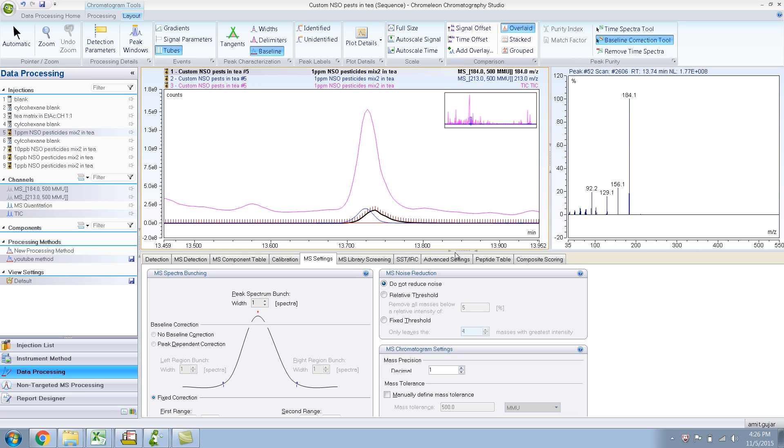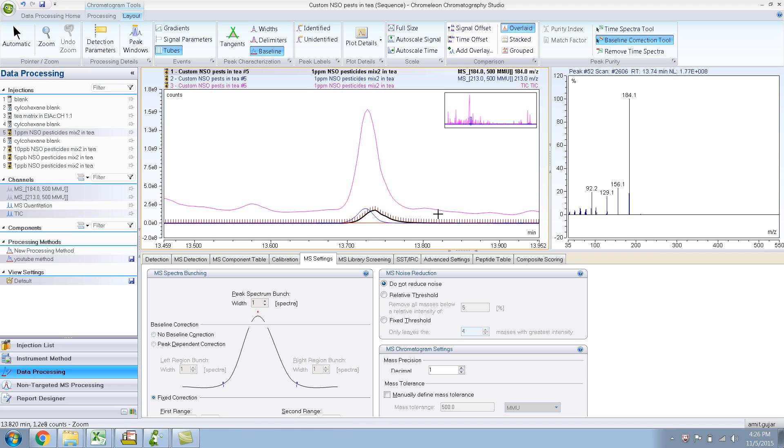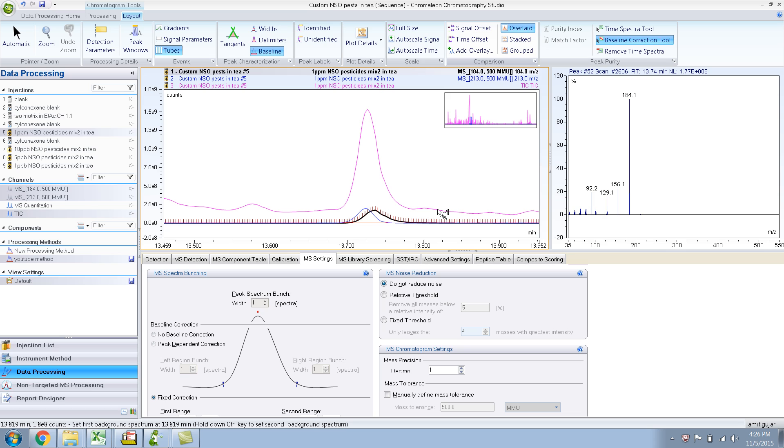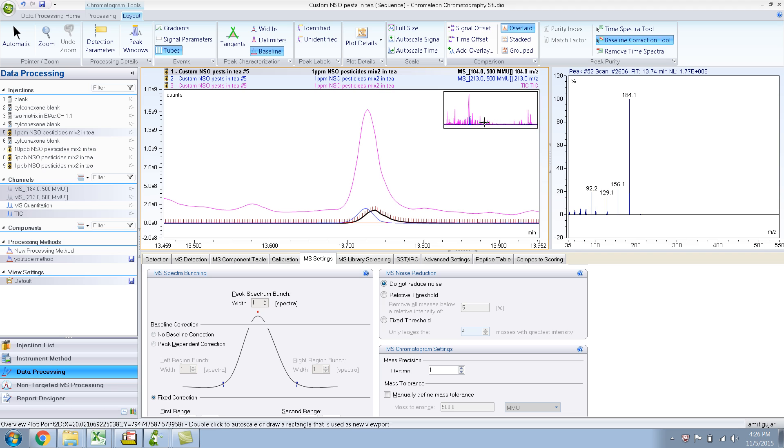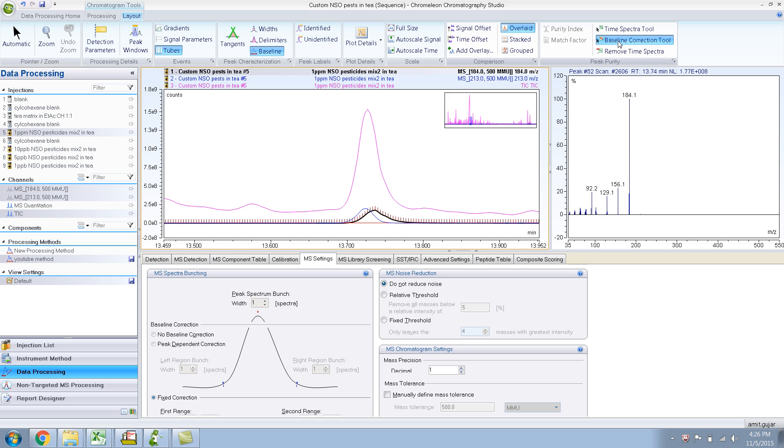In the last video I showed you how to use the Time Spectra tool and the Baseline Correction tool, and how to basically manually deconvolute your peak. Right now the Baseline Correction tool has been selected, and if I try to unclick it, it does not want to unclick. I think this is some sort of a bug.